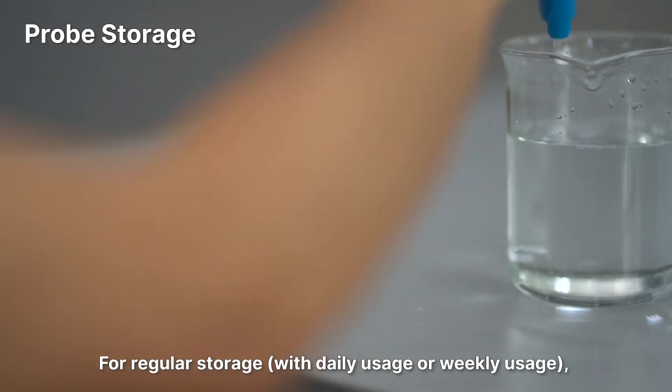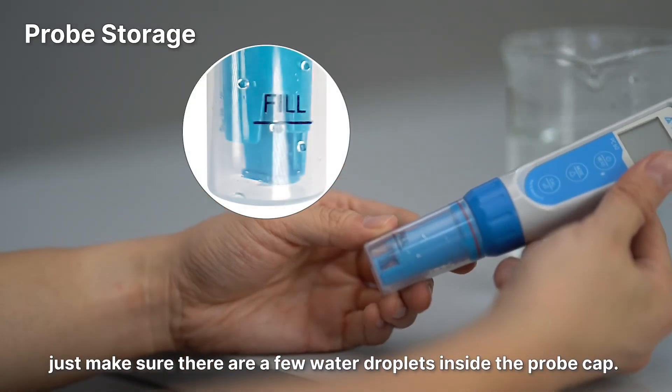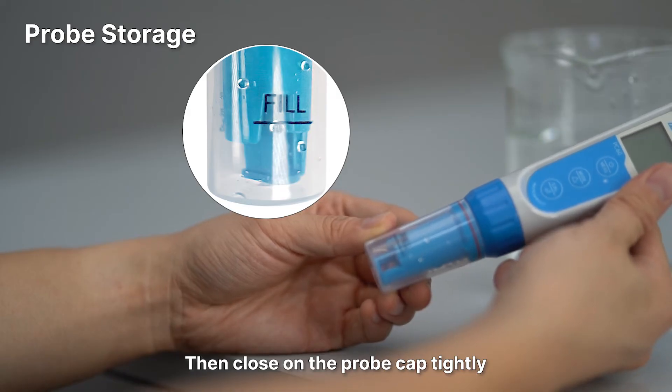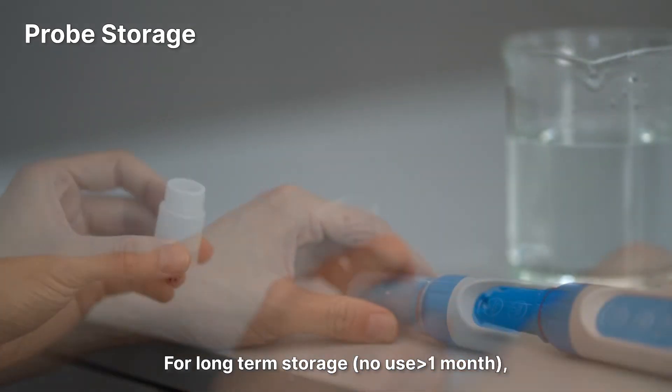Probe storage: for regular storage, make sure there are a few water droplets inside the probe cap, then close the probe cap tightly to maintain the humidity inside so the probe will not dry out.